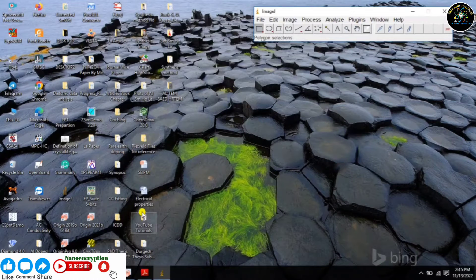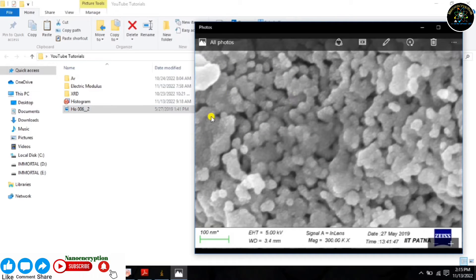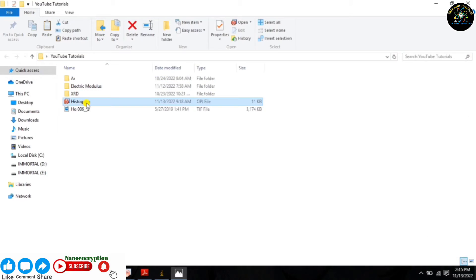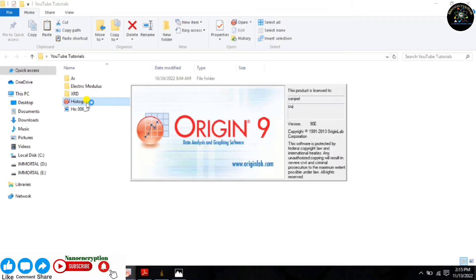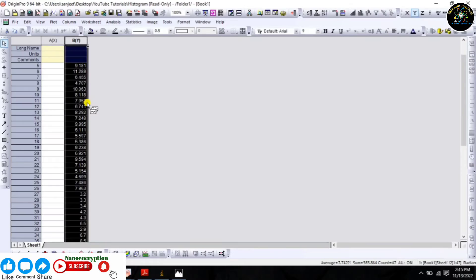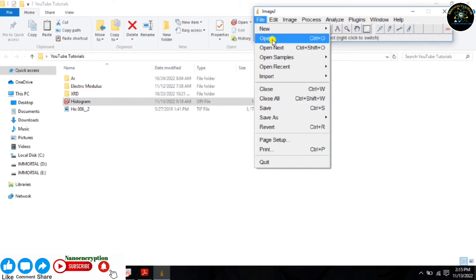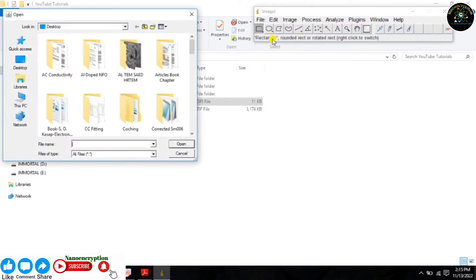First, extract the particles from the FESCM micrograph using ImageJ software. Just follow the steps precisely and carefully. From here, open the FESCM micrograph using ImageJ software.